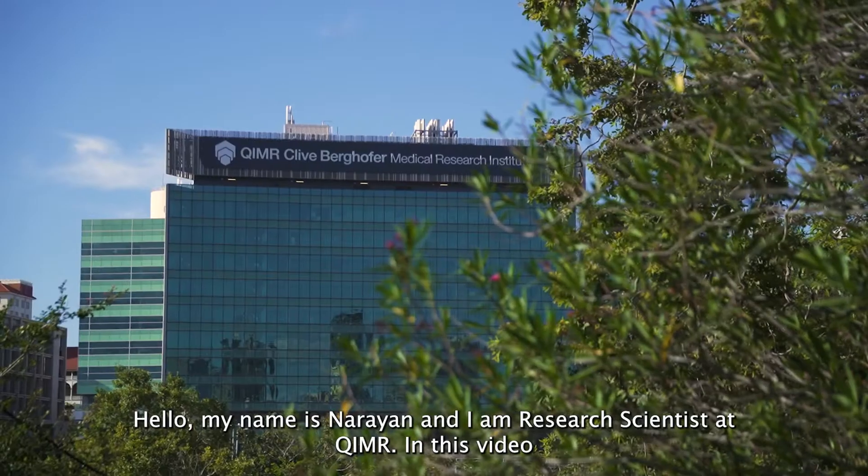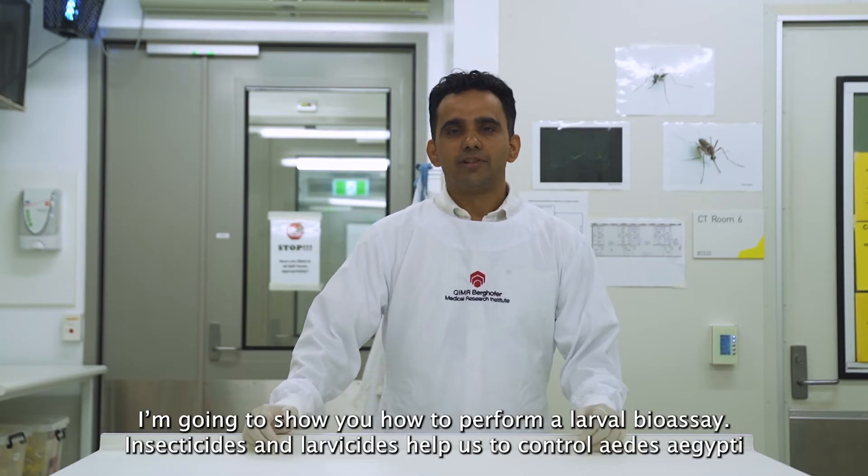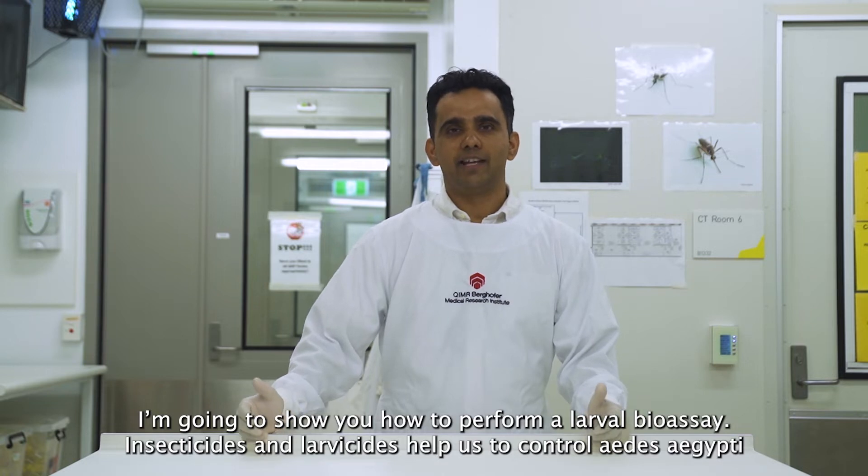Hello, my name is Narayan and I'm a research scientist at QIMR. In this video, I'm going to show you how to perform a larval bioassay.